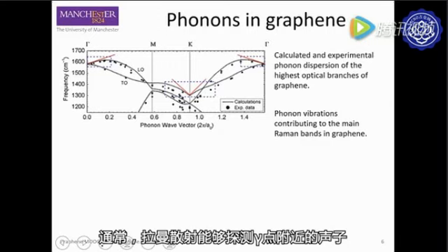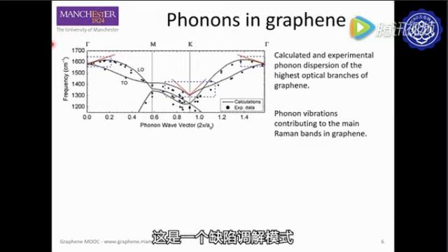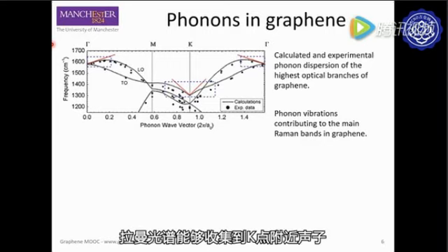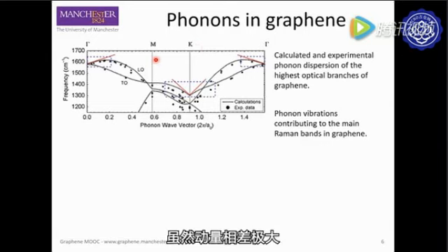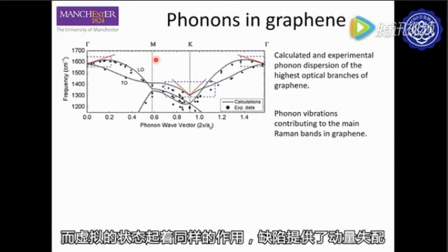Usually, Raman scattering is able to probe only phonons close to the gamma point. However, in the case of the D peak, which we will encounter later, which is a defect-mediated mode, Raman spectroscopy can sample phonons close to the K point, despite the large momentum mismatch. This can also happen in the case of the 2D peak. However, because this is a double resonance process, no physical defect is involved, but rather a virtual state which plays the same role as a defect provides the momentum mismatch.